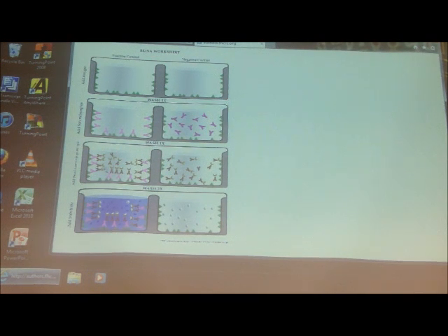And then we're going to go ahead and add the secondary antibody, which is an antibody against antibodies, and you notice it has these little curvy things on there, which is the horseradish peroxidase or the alkaline phosphatase conjugated to it. Then we add the substrate, and the substrate is converted by the enzyme into something colored. And so that's basically how it works.